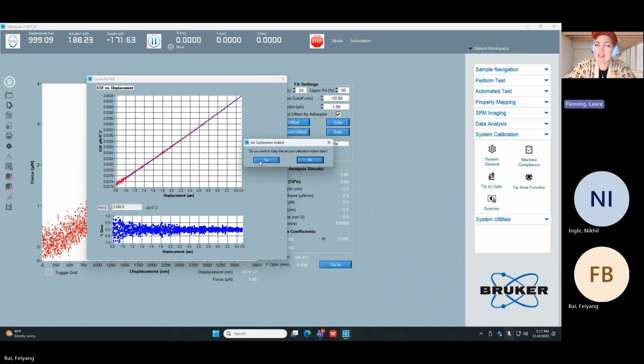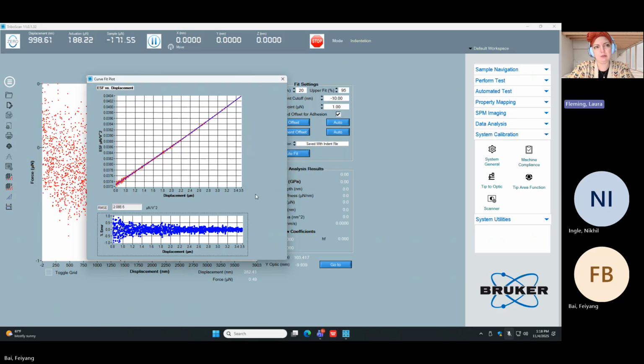Keep in mind, this is a 77, not a 950. The 950 had active anti-vibration and 300 pounds of granite, right? Yeah. And a big enclosure that had more soundproofing. You're looking at a different instrument here. It's still fully able to do the nano indentation. It's just that the noise floor is much higher on this instrument than it is on the 950.